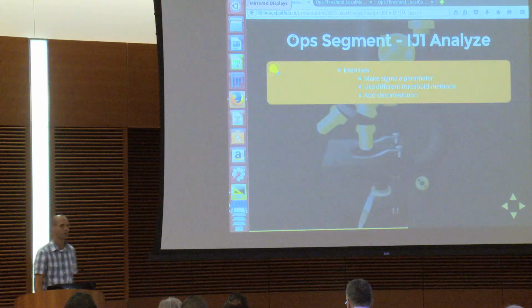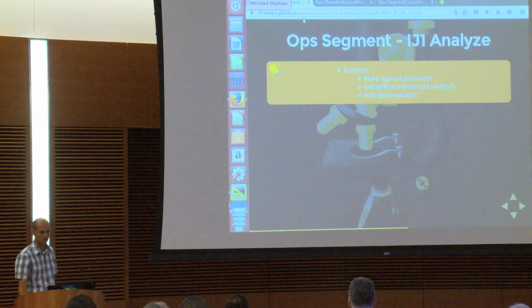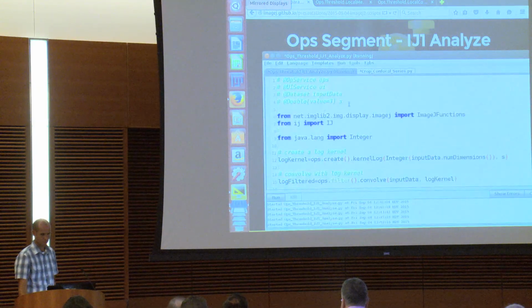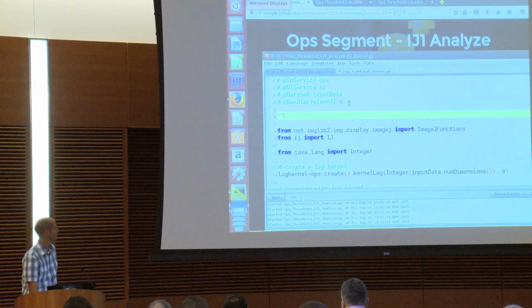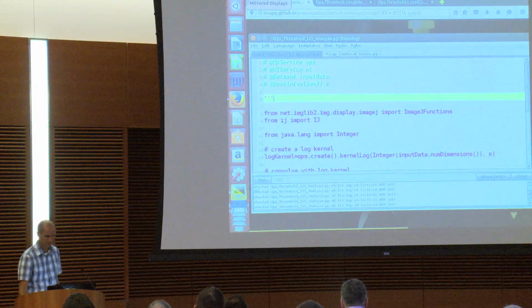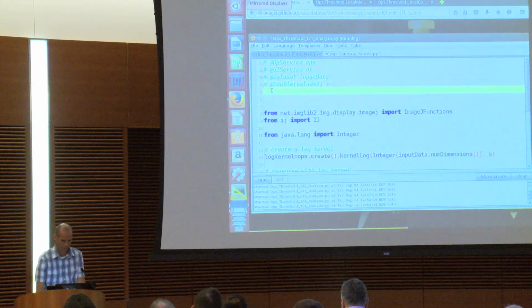So the final exercise here is to add deconvolution as a second pre-processing step. First thing I'm going to do, and here's a little trick that I use sometimes, is if you put 3 quotes, it comments out everything. So if you just want to test your parameter harvesting, or just the first part of your script, you can comment out the rest of it really quickly and fiddle around with it so you don't get all the outputs and everything generated.